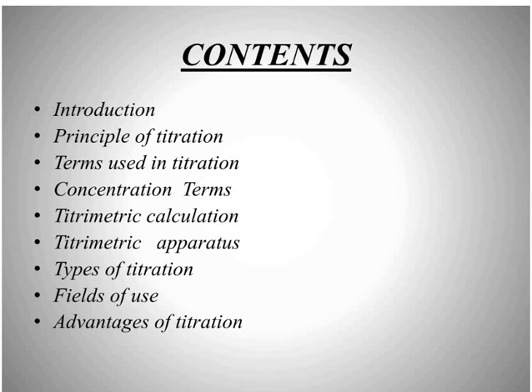Today in this video, I am going to talk about titrations. You know my friend, this topic is very important for chemistry students from 10 plus 2 to MSc. So we should learn the titration method properly.